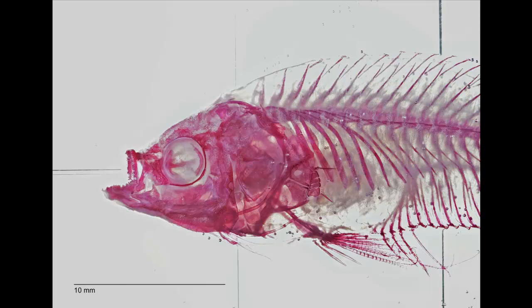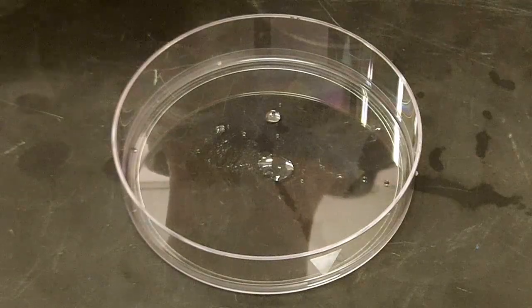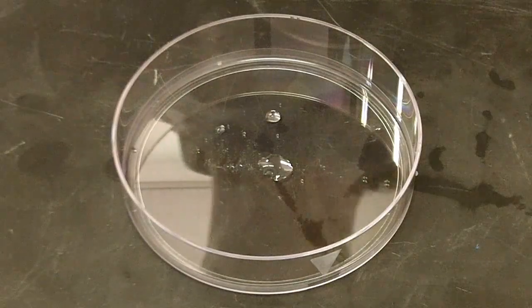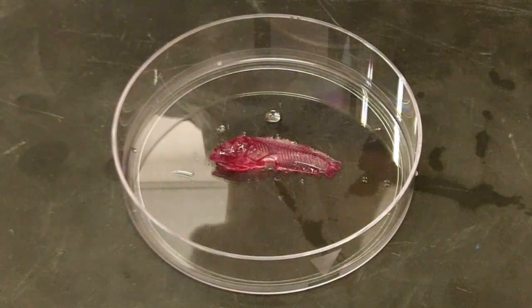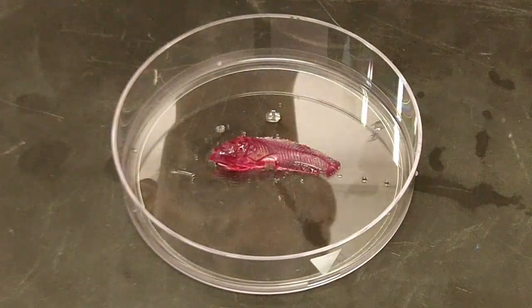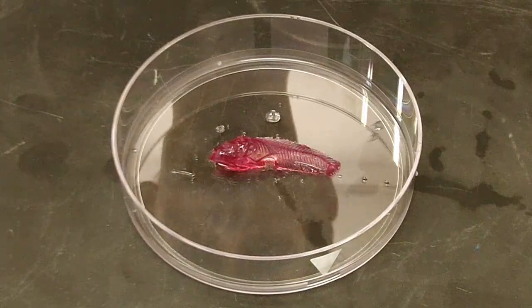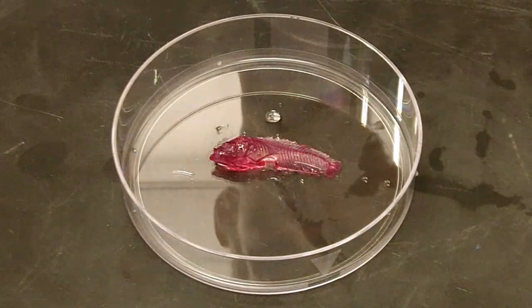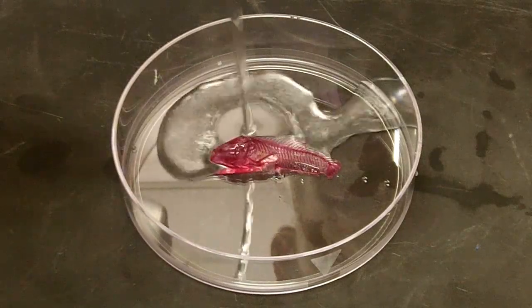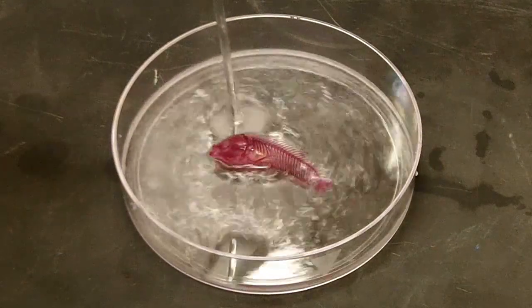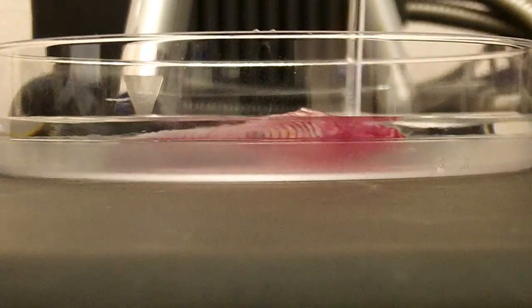The first thing I did to prepare each specimen was to remove all scales and loose tissue. The next step was to place the specimen in the petri dish, which I then filled with water such that the specimen was completely covered. I found water was the best medium to take pictures of the cleared and stained fish specimens in because it allowed for the least amount of distortion with the best picture quality.